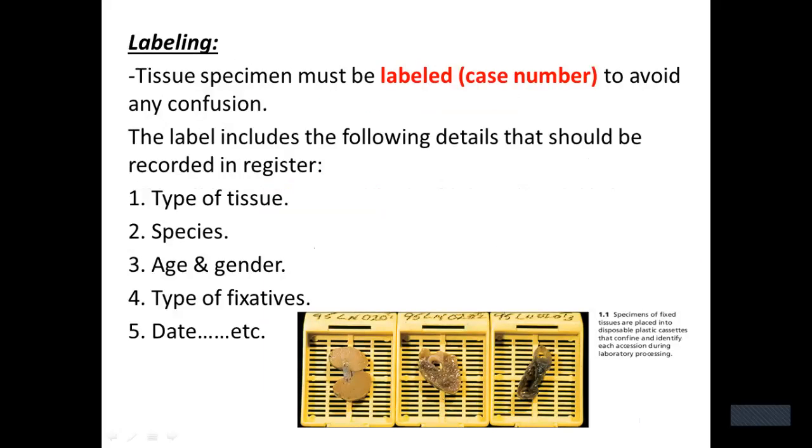The labeling of the sample. This sample inside the cassette or inside the container must be labeled. The tissue specimen must be labeled with the case number to avoid any confusion, and to take the right or correct name.